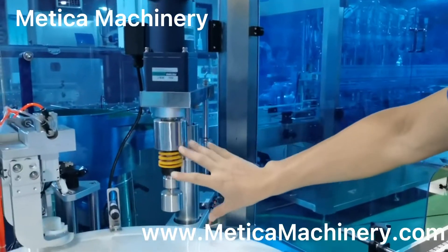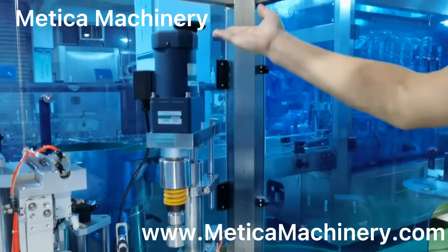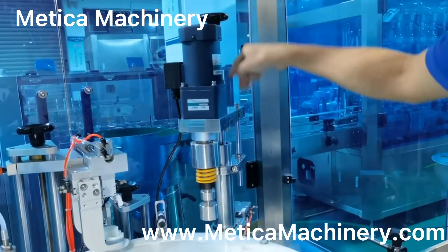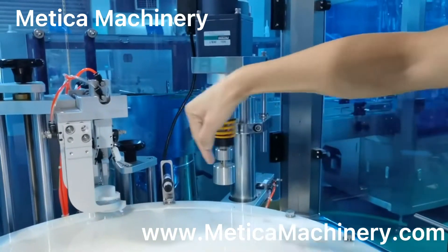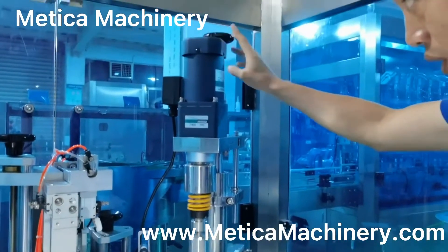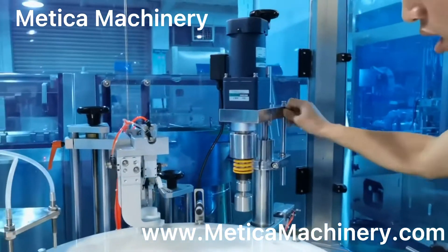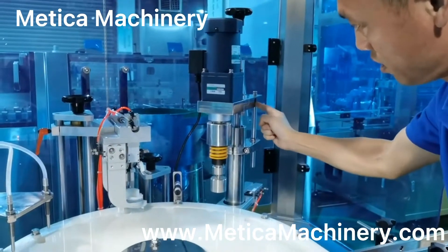This is the capping head. We can adjust the height from here — up and down. And also center, it can move this way or this way. For the height, if we need to adjust, we need to unlock this bolt, adjust, and then lock it again.